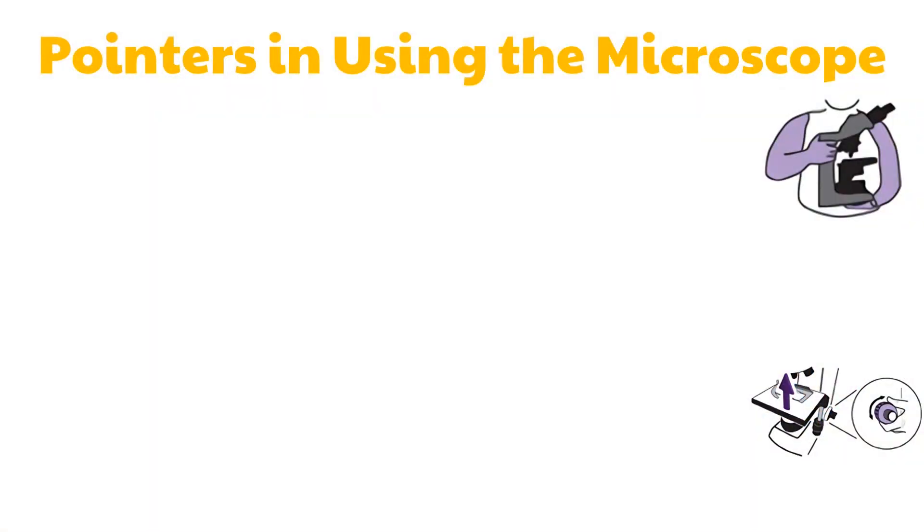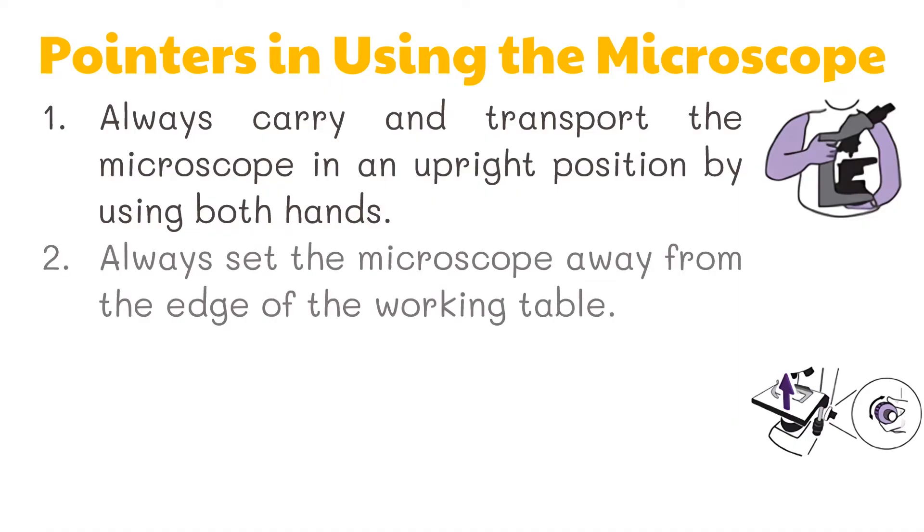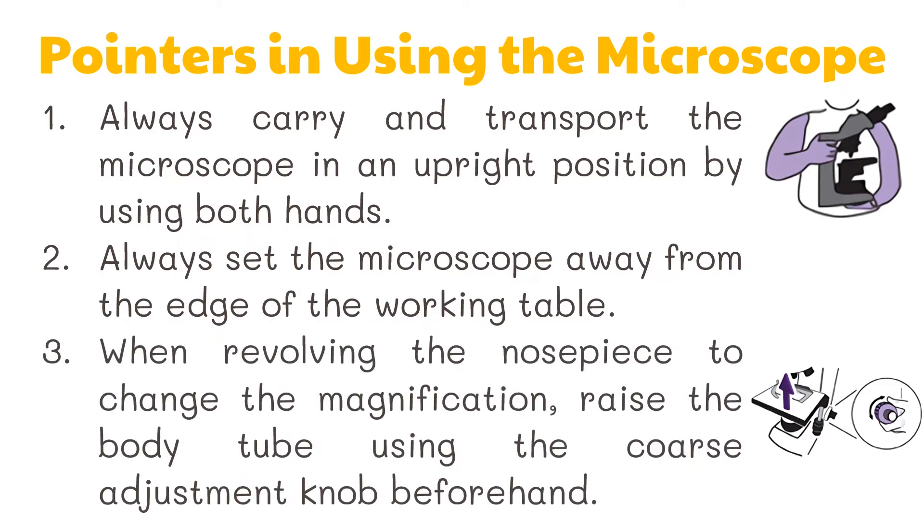Before using the microscope, here are some pointers to follow for its proper usage. First, always carry and transport the microscope in an upright position by using both hands — one hand holds the microscope by its arm and the other supports it at the base. Second, always set the microscope away from the edge of the working table. Third, when revolving the nosepiece to change the magnification, raise the body tube using the coarse adjustment knob beforehand. This is done to prevent breaking the slides and damaging the objectives.